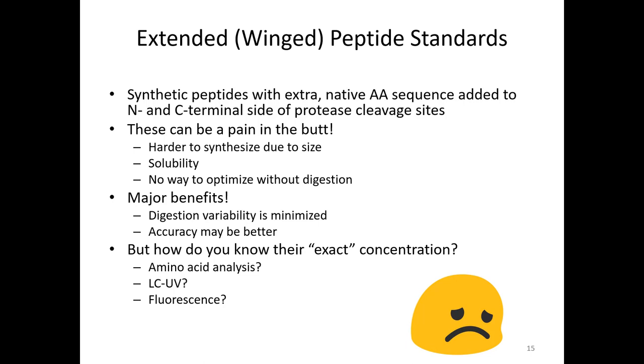Do you use LC-UV? If we use absorbance, we can calculate what the absorbance should be at certain concentrations, particularly if there are chromophores, which some peptides have. Fluorescence is more sensitive, so maybe we could use that aspect, but these are not commonly used techniques. Most mass spec labs don't have a spectrofluorimeter or one that they can use online.